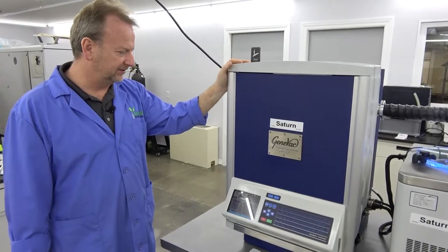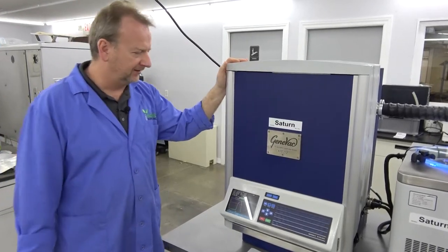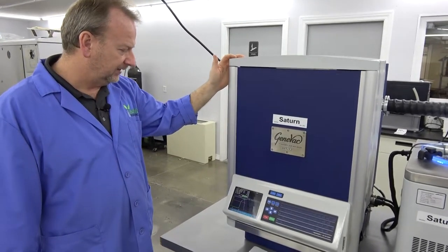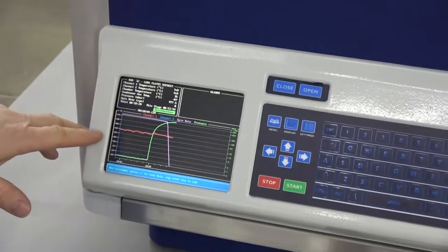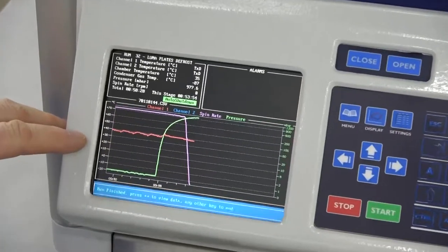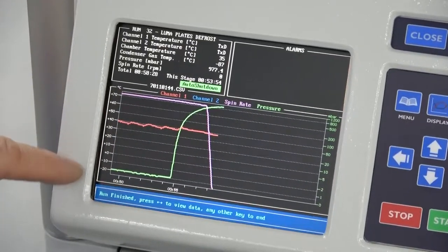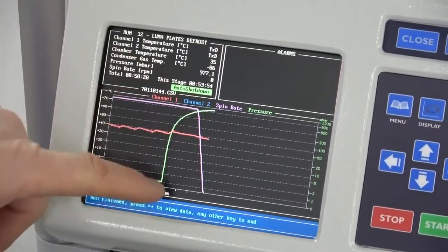All right. I believe it's spun down. The door is ready to open. But I just want to get a shot of our screen again. You can kind of see the scale as everything was spinning down and the vacuum was released here. You can see the charts here and here.